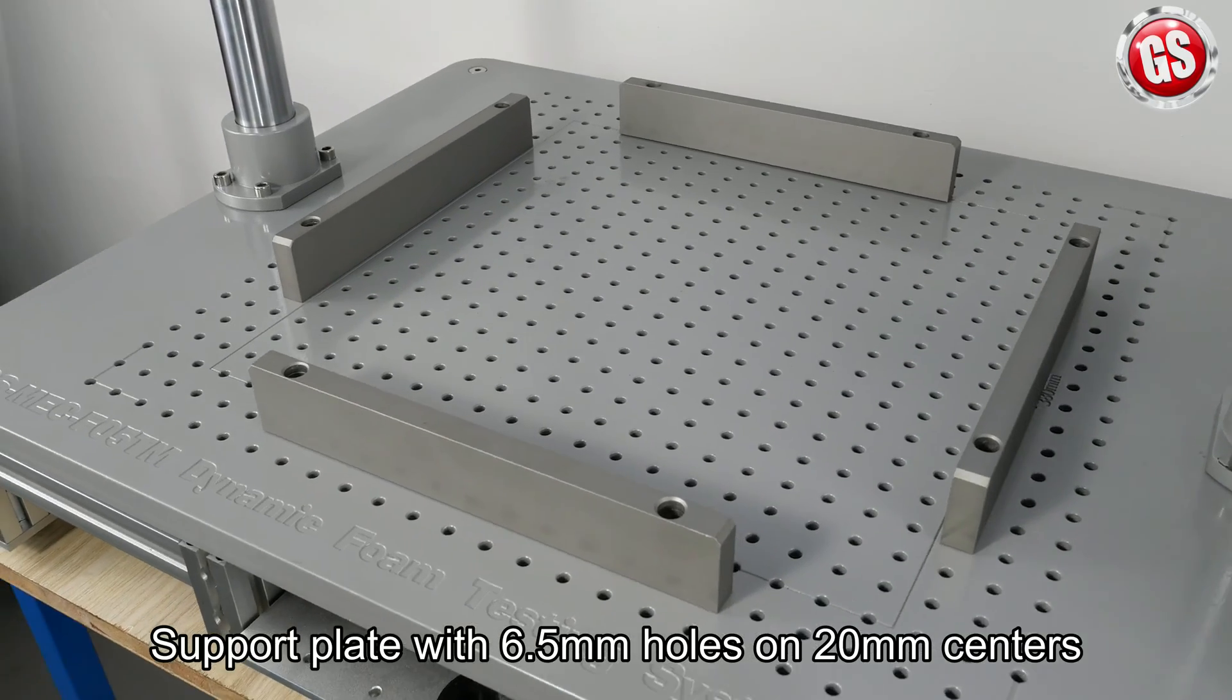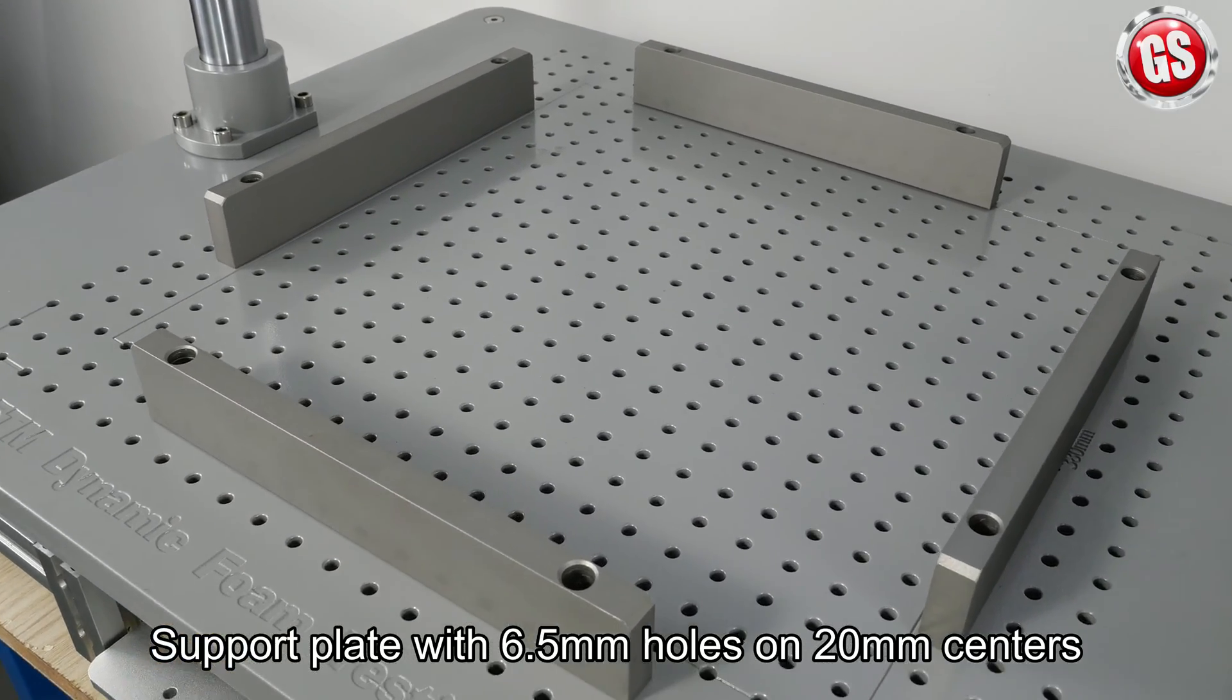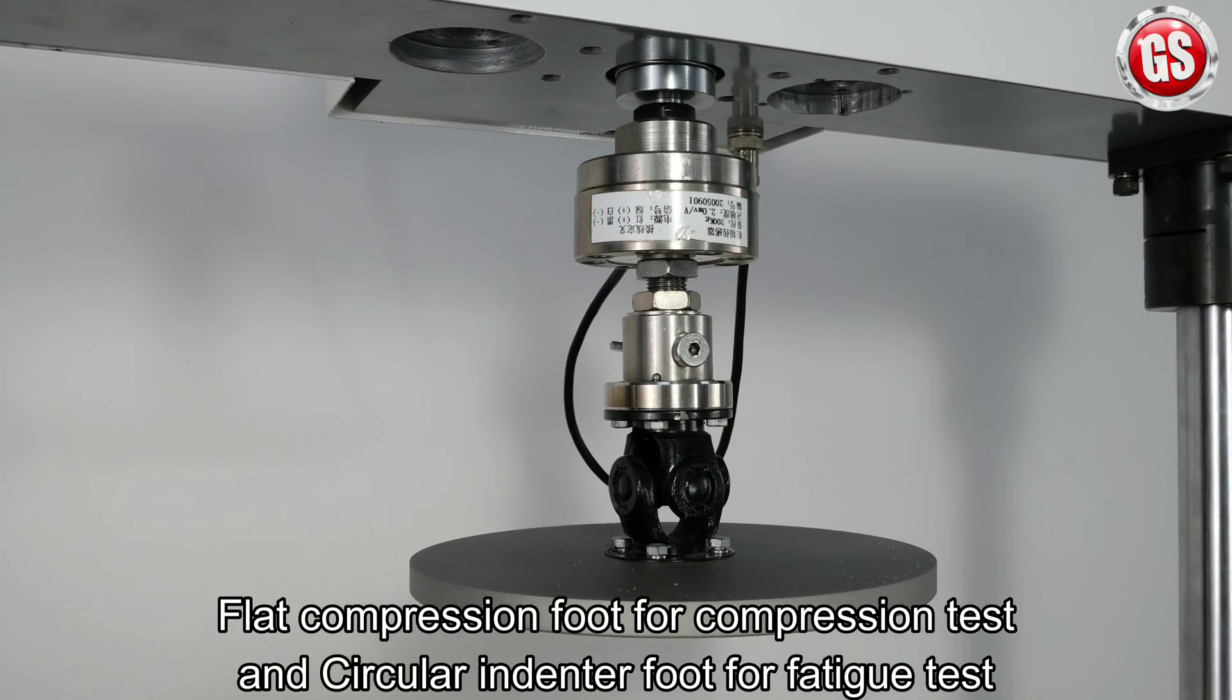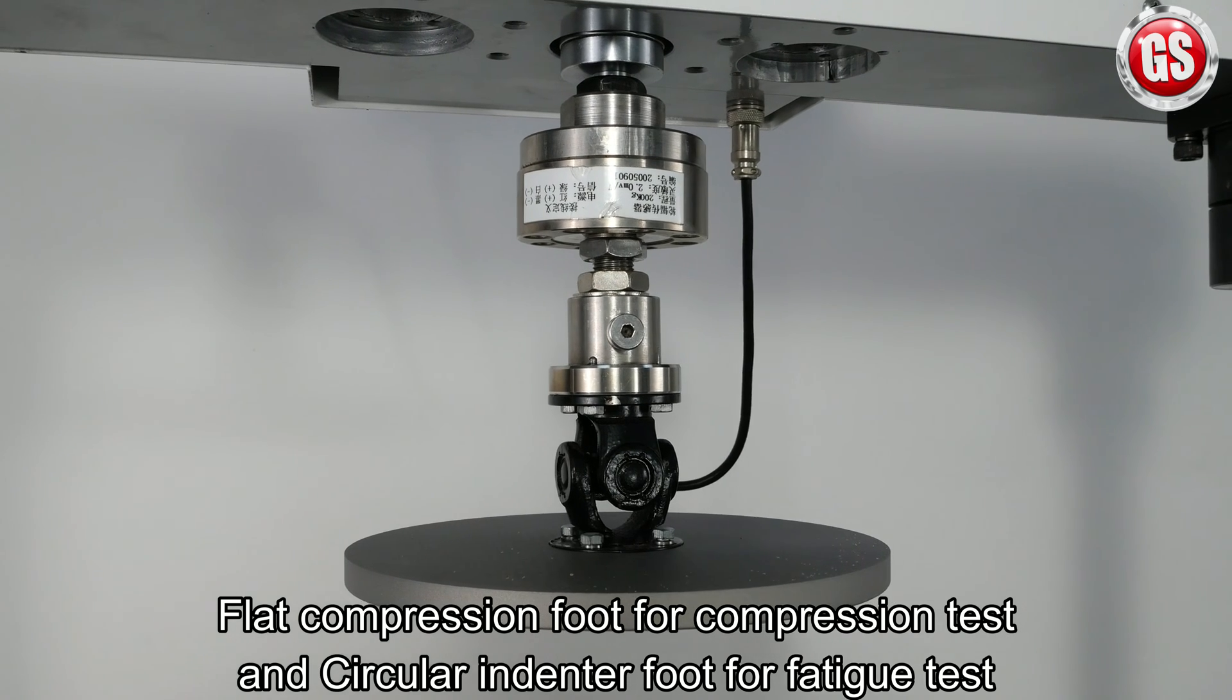Support plate with 6.5 millimeters holes on 20 millimeters centers. For different tests, you only need to change the foot.